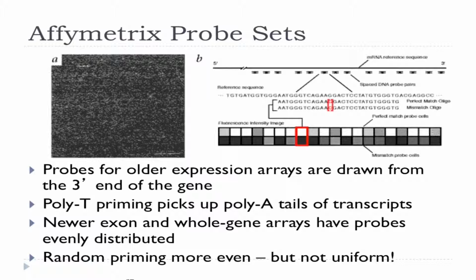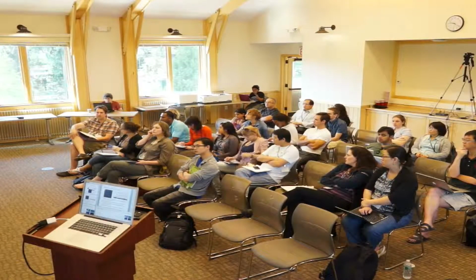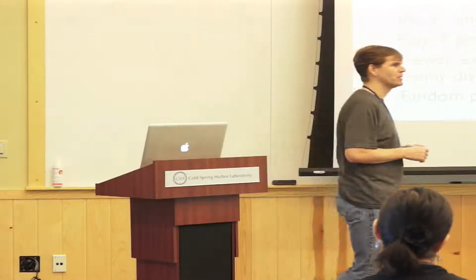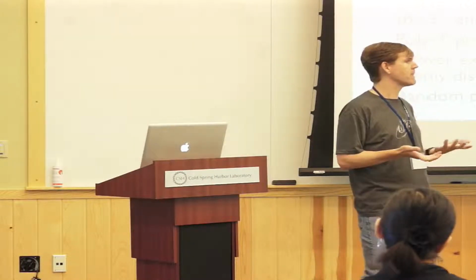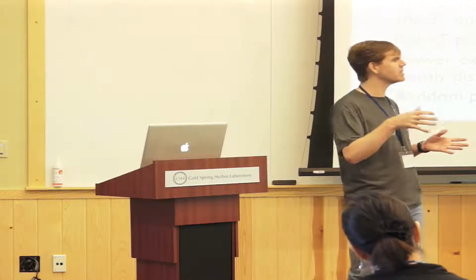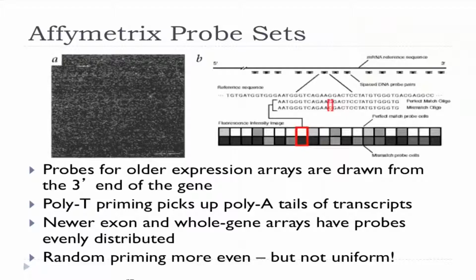Yeah. With the mismatch probes and the higher signal, was that from genetic heterogeneity in, like, human populations, or was that just weird hybridization? So these are 25-mers. And unfortunately, 25-mers are not very specific. And when you account for the fact that hybridization can happen even for nucleic acids that are quite different than the probe itself, they can still hybridize. You can get this situation where even though the mismatch probe is not actually in the genome, there are many places that are very similar to it, so it can still hybridize.